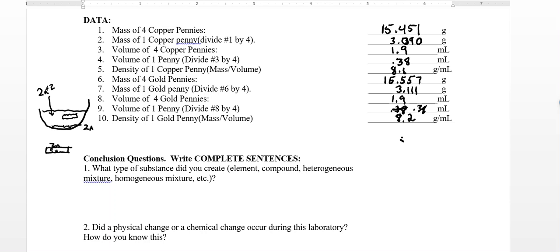Now, the other key thing about zinc and copper is that their melting points are very close together. So once you hit the melting point, I think zinc is first. Once you hit zinc's melting point, not too far beyond that will be copper. So they basically are going to melt together. They will melt together so that once they start melting, some of the copper will bubble up to the top, kind of shoving the zinc away.